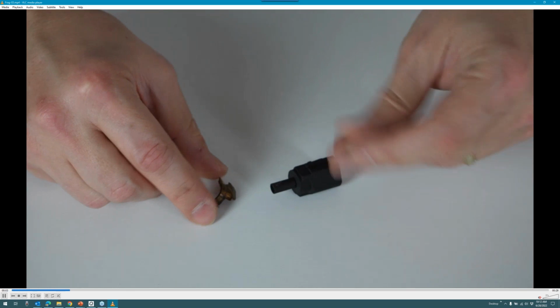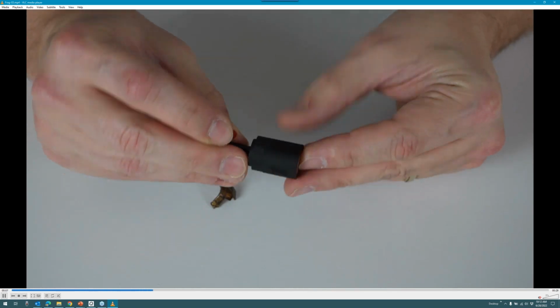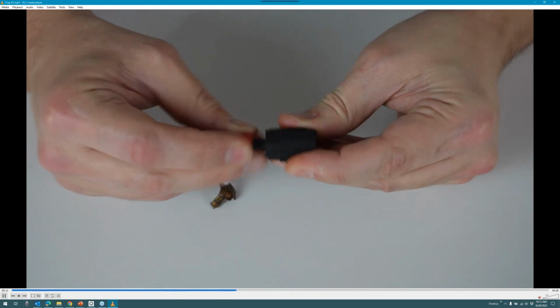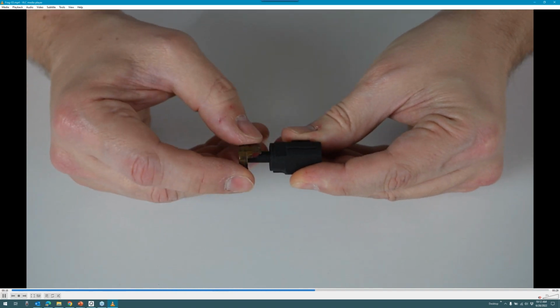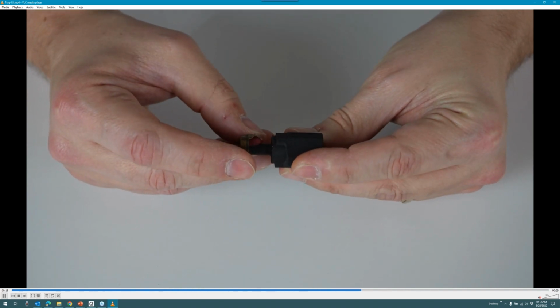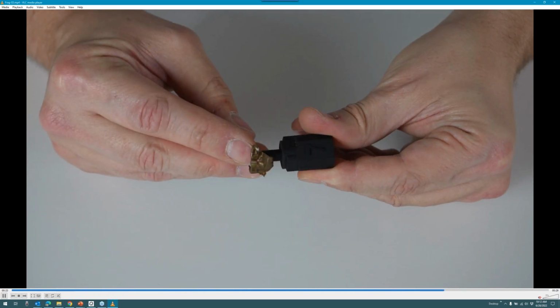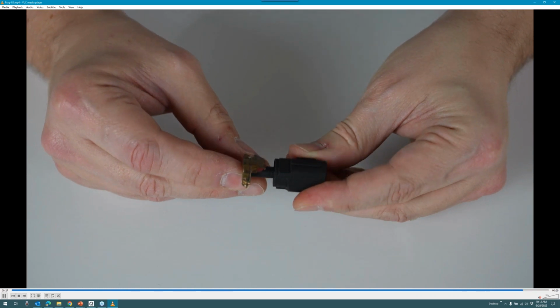There's the fragment, there's the stub. Go around, locate the dash itself. Fragment is placed in the wax, and now in the softness of the wax, I'm going to twist the base to get it as square as possible. I'm going to play with the tilt of the fragment as well to try to get it as flat as possible. And as long as I have a clear view looking straight down at it myself, then the camera should have a clear view of it as well once it's in the machine and ready to be acquired.